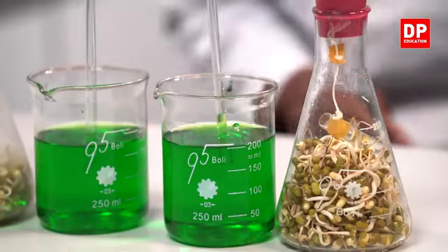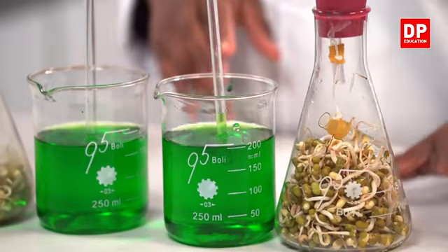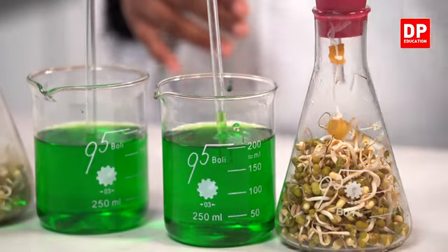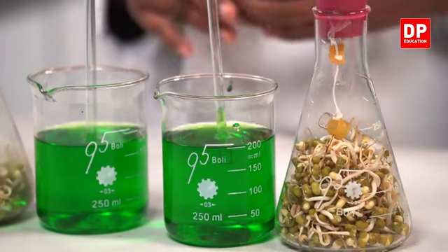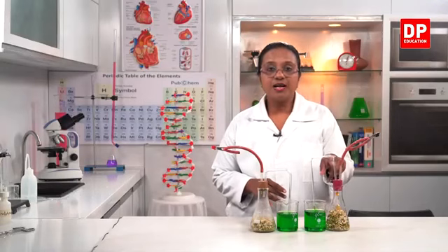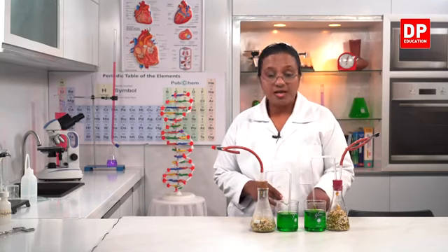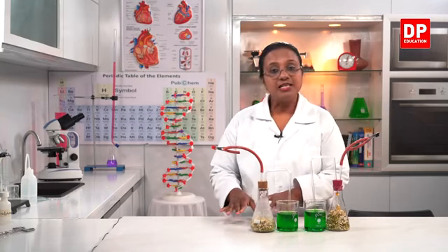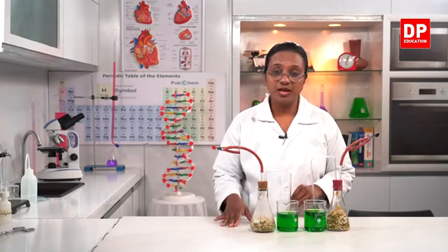So now here you all can see the water level rising in this setup. That is because oxygen is being inhaled, carbon dioxide is evolved, but that carbon dioxide is absorbed by KOH. So to fill that space, air from the glass tube flows into the conical flask, and to fill that space, water from the beaker rises up the glass tube. But that does not happen in the second setup. Why? Because there is no KOH.